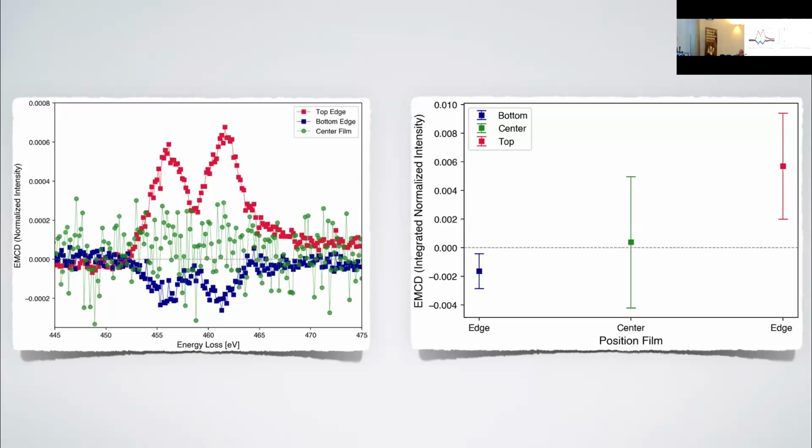So my question is, in these kind of devices, you would also have a temperature gradient, because the central part of your wire will heat up more, and towards the edges it will be different. I do the measurements in the center. Yeah, but you would have a gradient of temperature, of the material due to the current. Yes. But we calculated how much current we are using, and it's tiny with respect to the material.